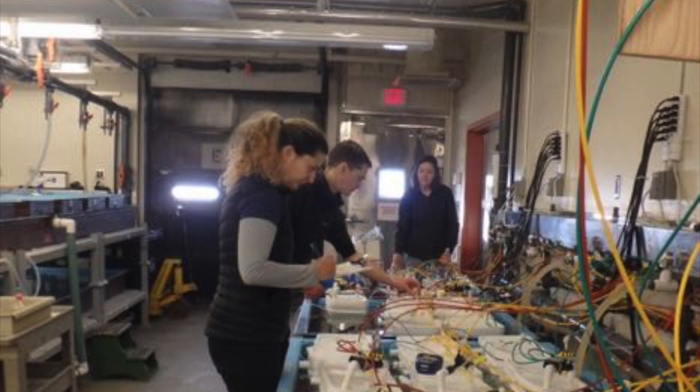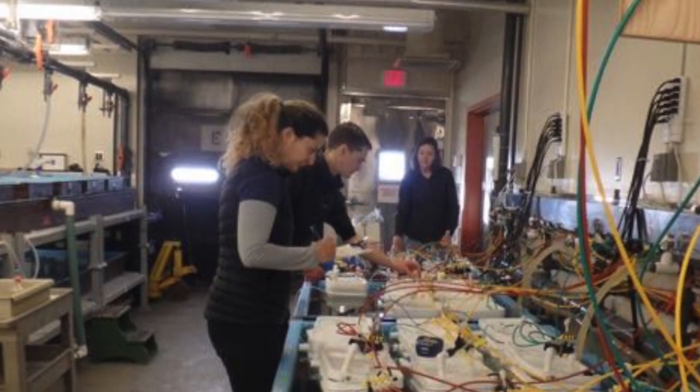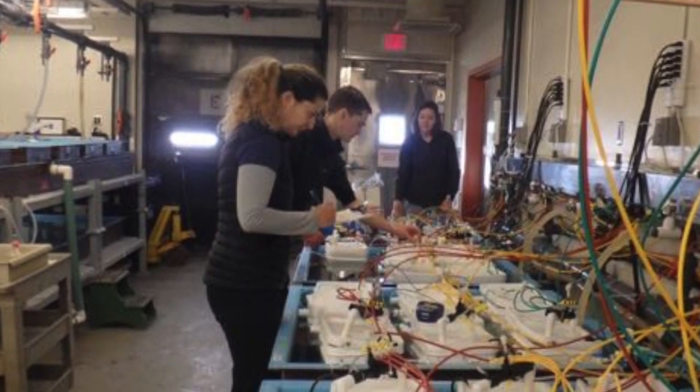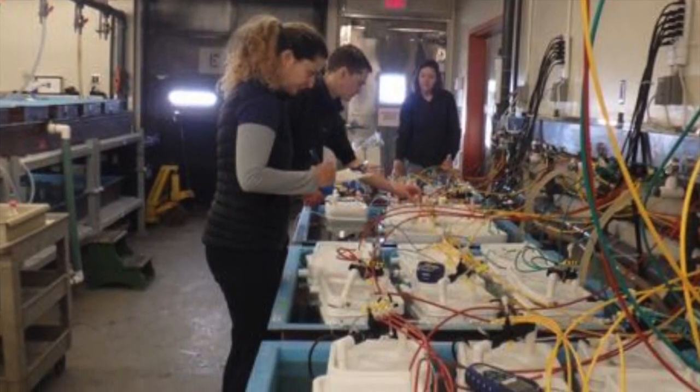It is important that all conditions are stable in each tank before we begin. There is way too much at stake to have mistakes. Today, Mandy, Melissa, and Andrew are doing water chemistries again for every separate tank in our system. They have been checking them regularly since they set up the tank weeks ago.